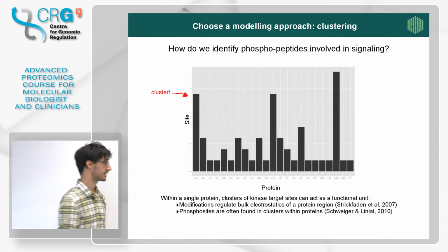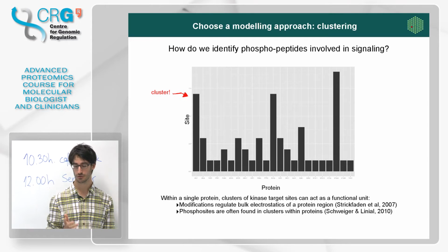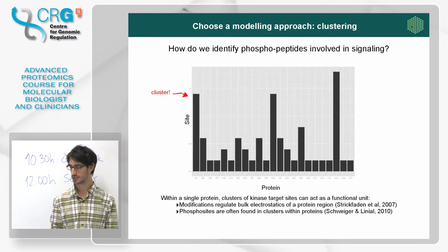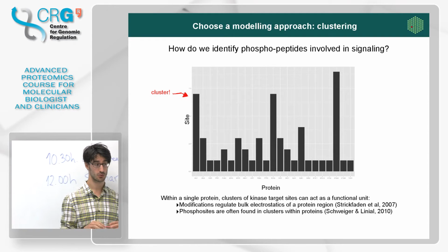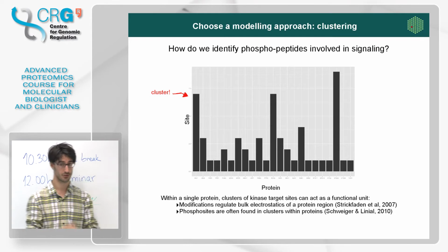Another approach that is interesting is clustering. And I want to illustrate one way you can use clustering to answer a question that appeared to us when we were using the data set in the paper that I mentioned before. Same paper now, so same data set.